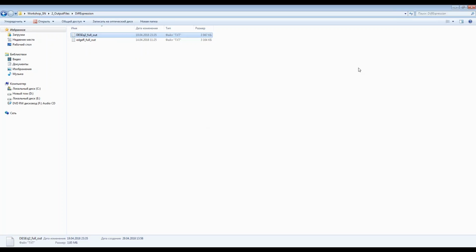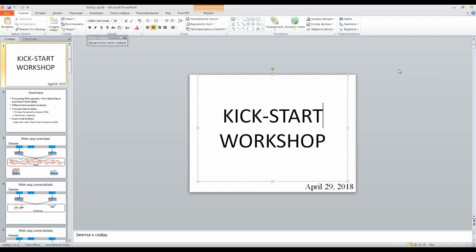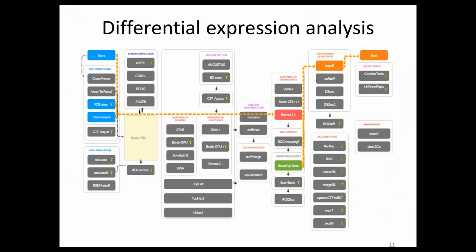Now we created the pipeline, and I think that's all about differential expression level. Next, we will.